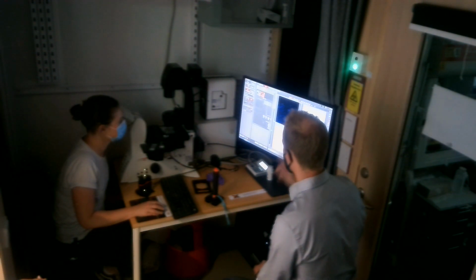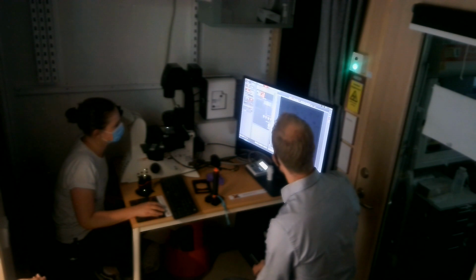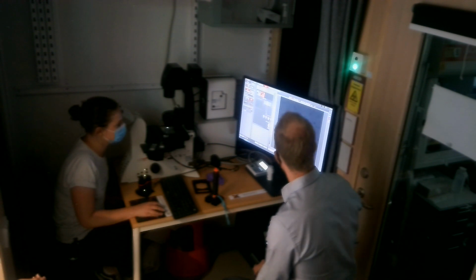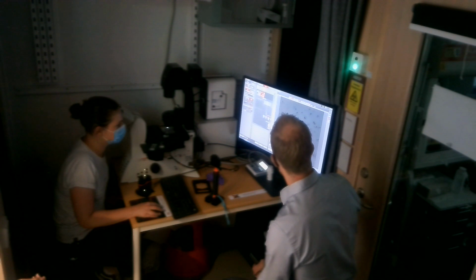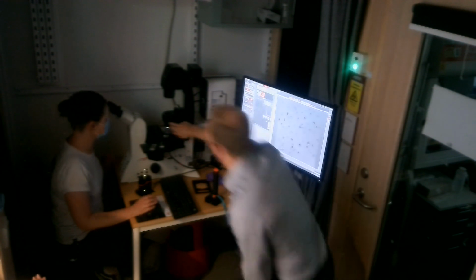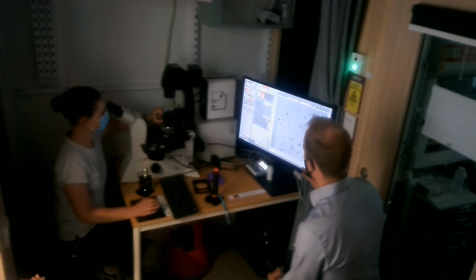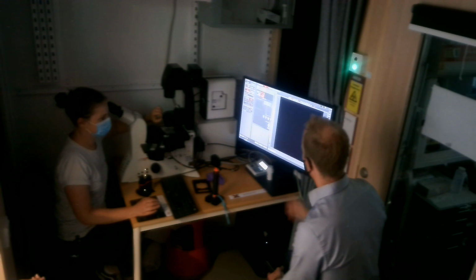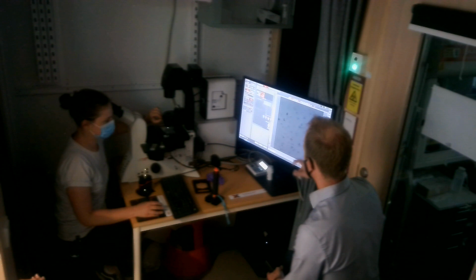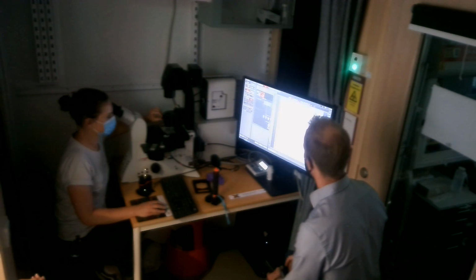Something here also, maybe if you go to Acquire here, and we're on Brightfield. You can go live, the Brightfield. So here you can drag this down a little bit. Only with Brightfield I tend to maybe change the exposure time or so. Now you can adjust the aperture diaphragm a little bit. When you work with Brightfield, you can actually use that one. You go quite far, so you see if something happens, and then you have to increase the exposure time a little bit to compensate. If you close it down, you then just brighten up the image a little bit.